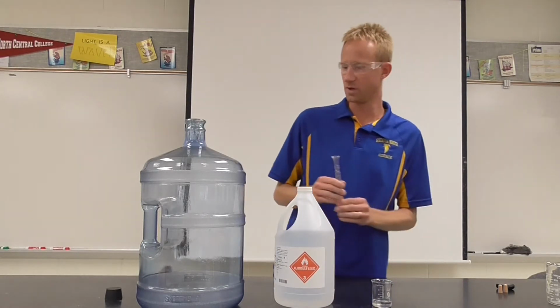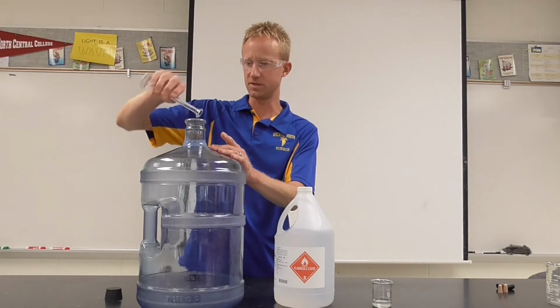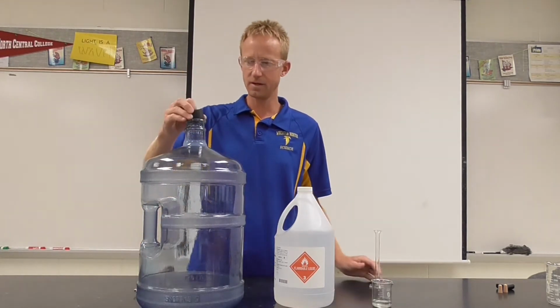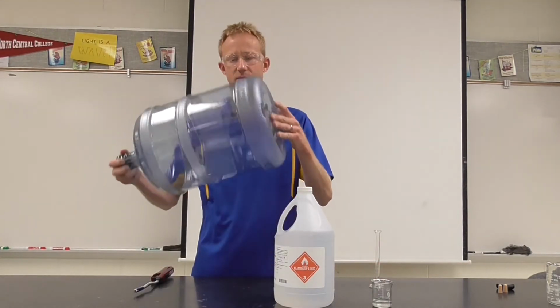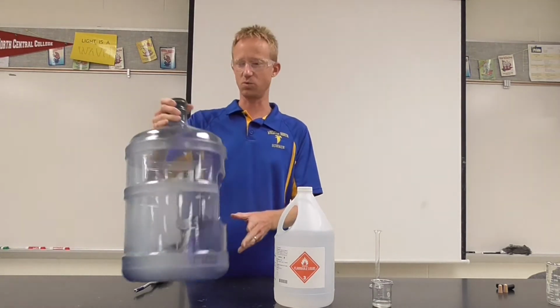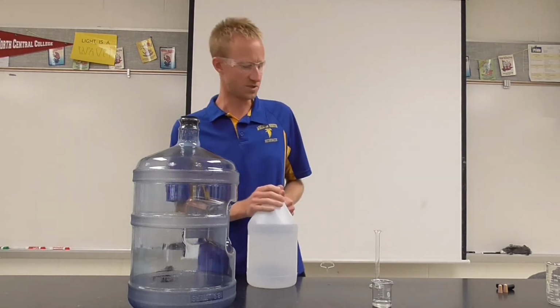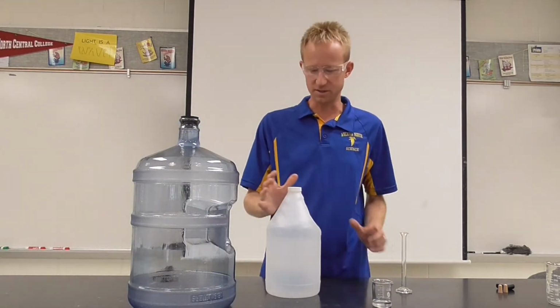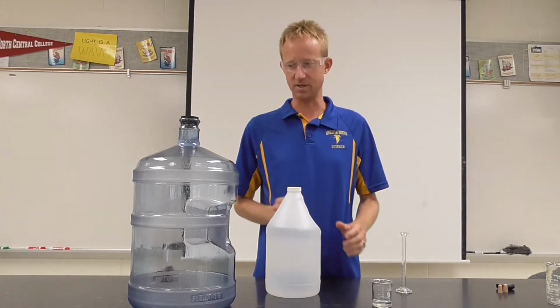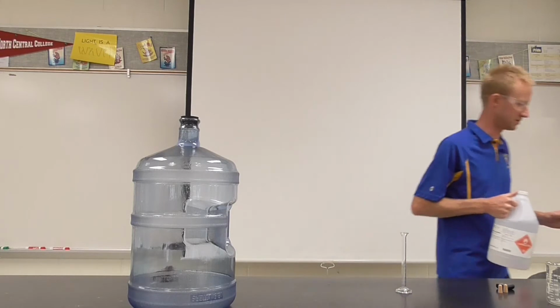So what we're going to do, we're going to pour the 10 milliliters of methanol into this jug. And you know that a flammable substance typically vaporizes, so we're going to vaporize it. So what we'll have in here is methanol vapor, and we're going to combust it. What's important when you do any combustion reaction, if you have a flammable source, is that before you actually execute your experiment, you remove the flammables.